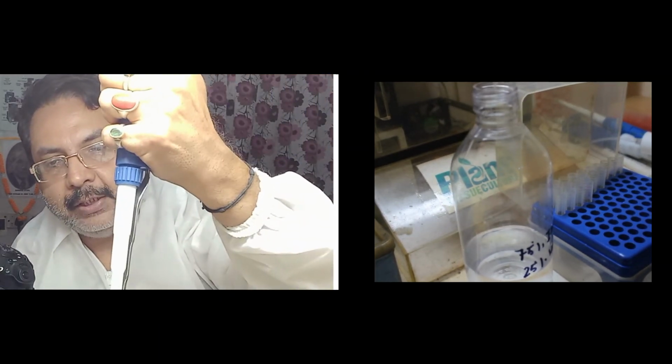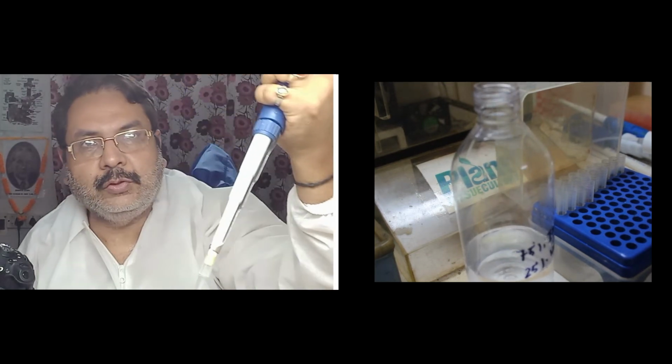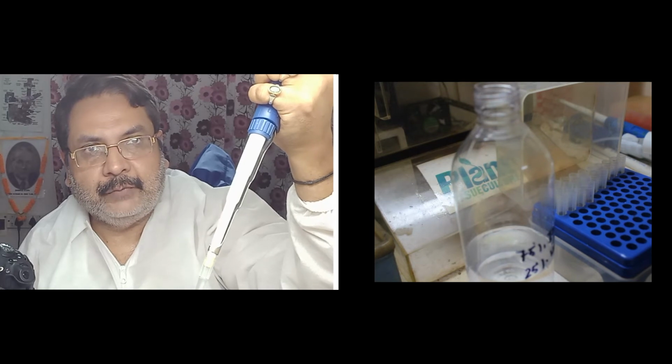Now how to release it? Go inside and slowly release it. Push the plunger and the liquid will be transferred. Now take it out. Don't do this, because you will let all the air bubbles inside. You first push the plunger and take out. So this is how to use the auto pipette. Don't fully dip the tip. You just dip the tip a little bit, just the mouth of the tip.